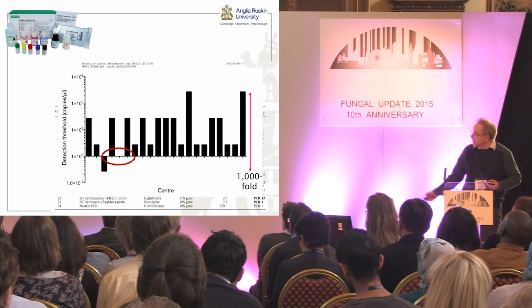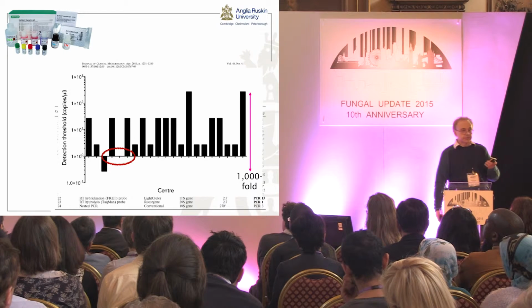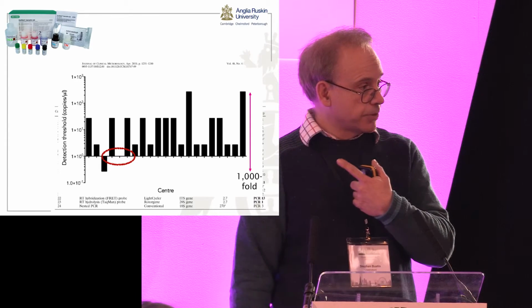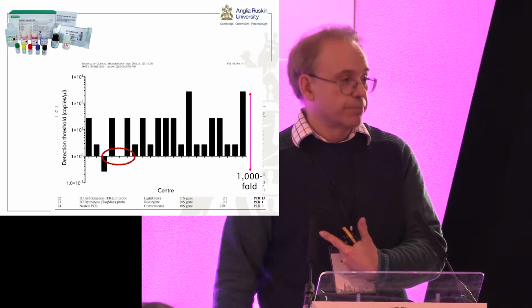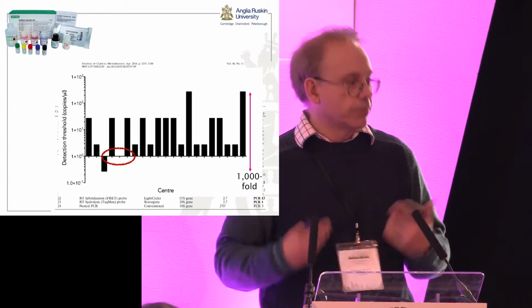And one of the labs didn't get any results at all. I think you just discussed the inclusion of PCR criteria into your guidelines. I think you have a real problem there, because until you've managed to get people to get the same assay, the same levels of sensitivity, you will still have the problems they have today. And I think someone needs to really look at which assay to use and how to use it properly.